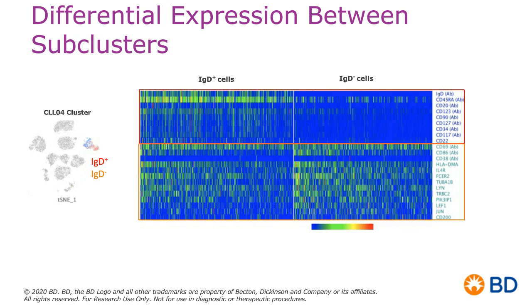And of course, interestingly, we have confirmatory data from when these samples were collected and from some flow cytometry information. Even though we've used this AbSeq and single-cell multiomics approach to really interrogate and dig into these populations, we kind of knew from the beginning that there was probably going to be something unique about sample CLL4.